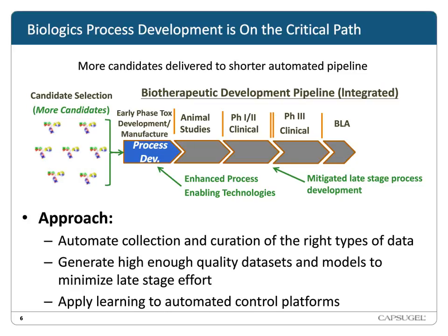This predictive modeling approach also allows the nomination of a control strategy for each process very early on in the development pipeline. It also makes it so that the early phase data can easily be applied to process robustness studies later in development if required.